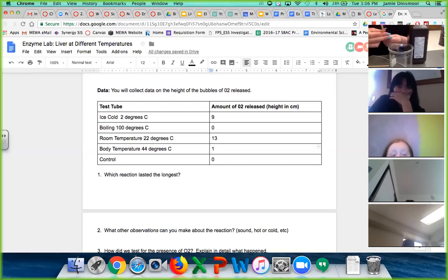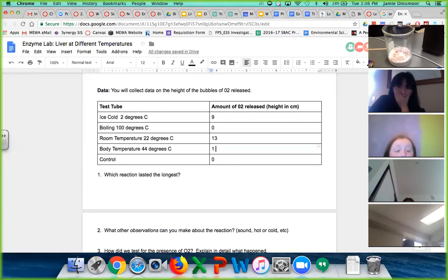Hardest part is getting these sticks to make an ember. You have to be very gentle. Okay, we got a little ember. Nope, the ember's still there. Okay, gotta try again. So I'm saying there's a 92% success rate. I might have to try a few times before I get it. But the good news is the reaction's just gonna keep going on and on and on.